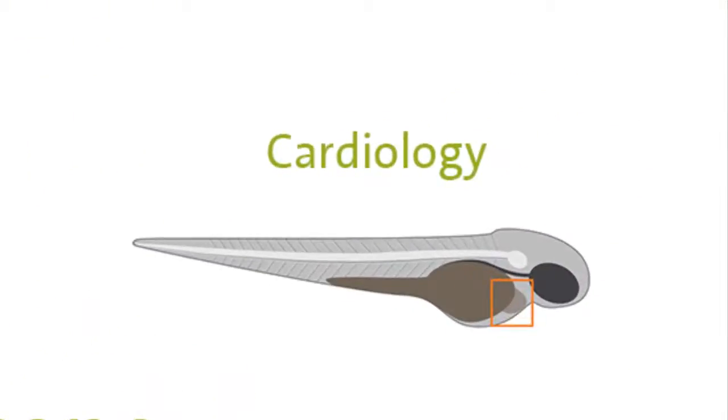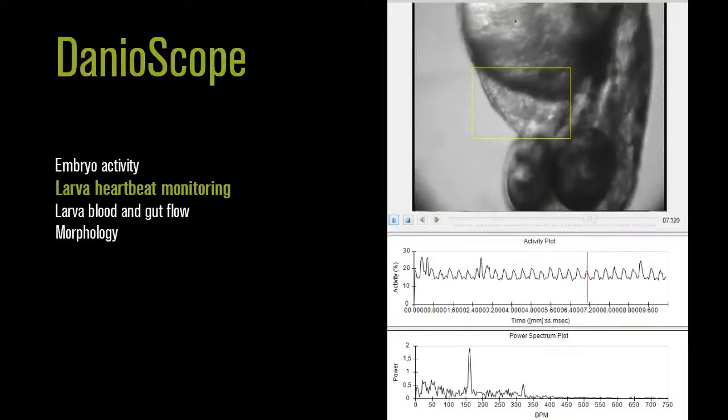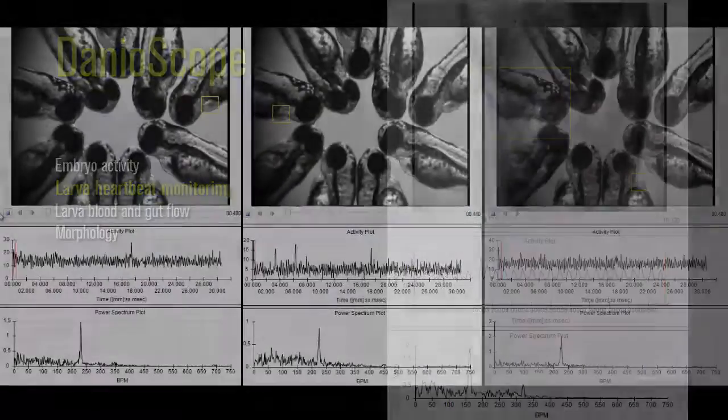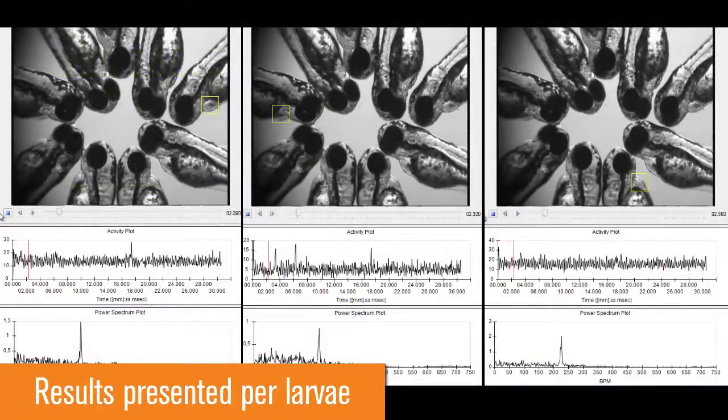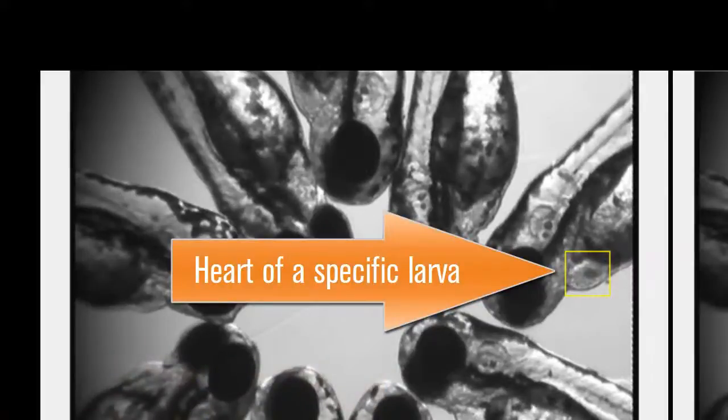You can also measure the heartbeat with DanioScope. Here you can see the heart of one larva selected. Again, you can measure all your animals simultaneously and results are presented per individual.